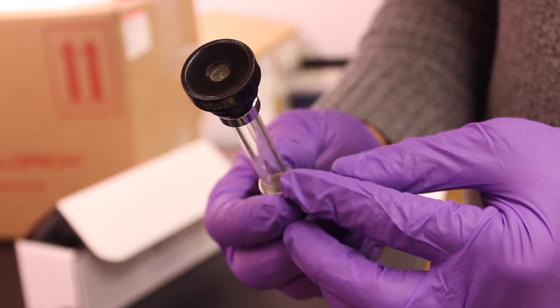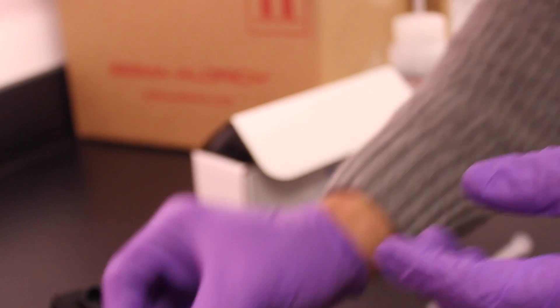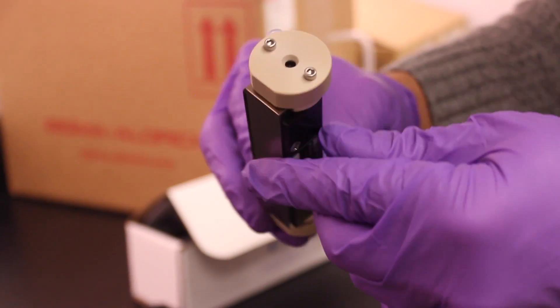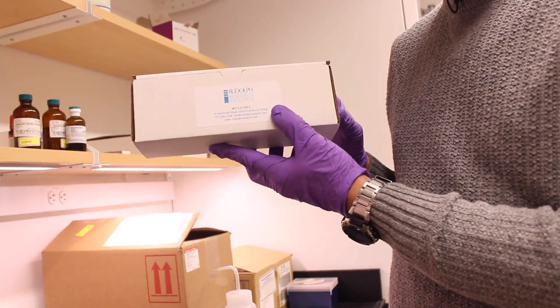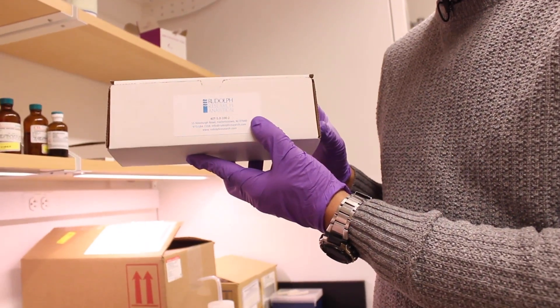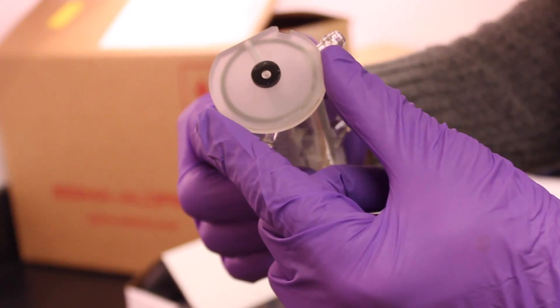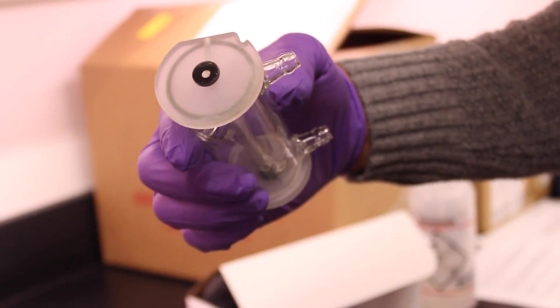Although polarimetry cells of this type can work with the Rudolph Polarimeter, it's recommended that you use a temperature-controlled cell like this. The CBIC has a cell that can be signed out for short-term use, but it's recommended that each lab get their own temperature-controlled cell for regular use to avoid sample contamination and other problems. Other types of polarimeter cells with different diameters are not compatible with the Rudolph Polarimeter.